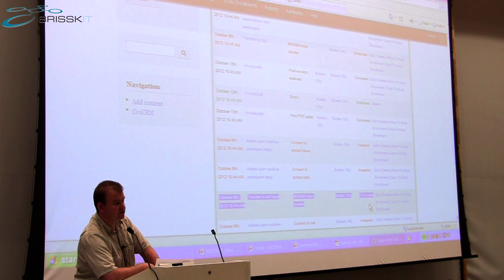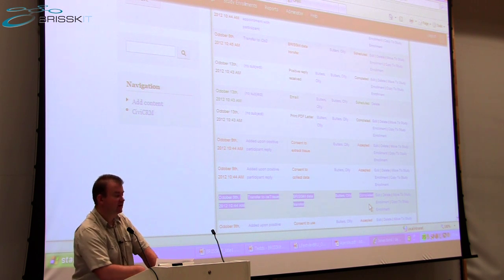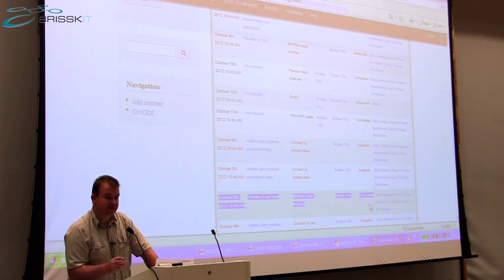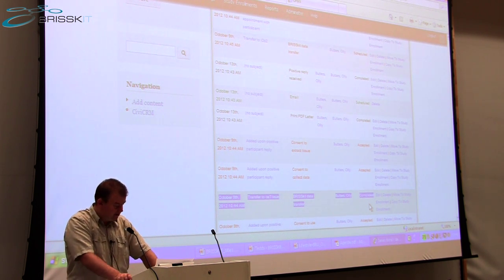There's a once a minute monitoring process that just checks for those jobs. It's picked up that job as waiting to happen, the data transfer, and it has now finished it. So that job of transferring the patient into CA tissue is now marked as completed.